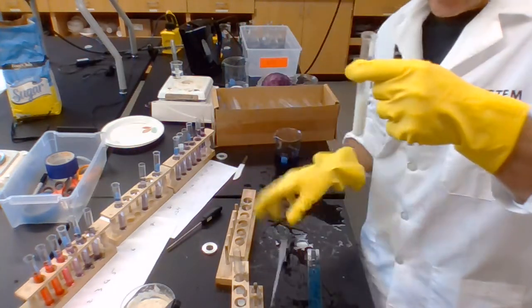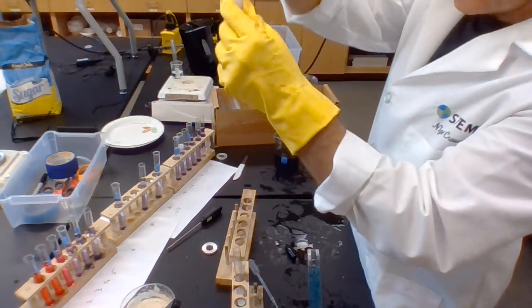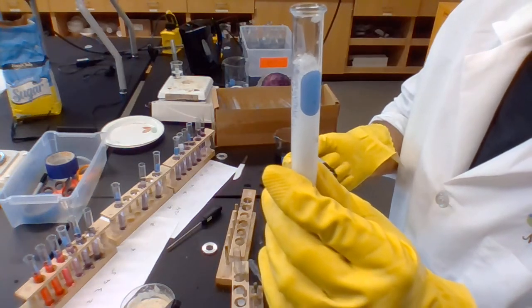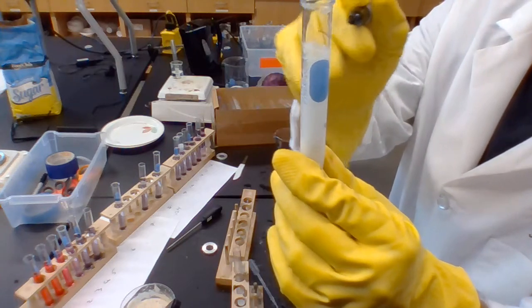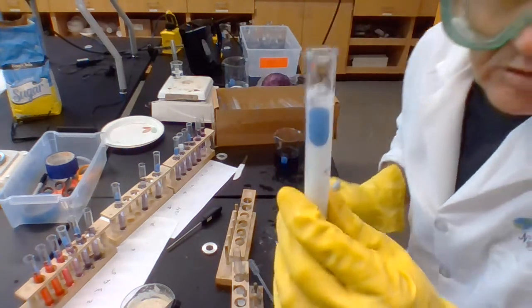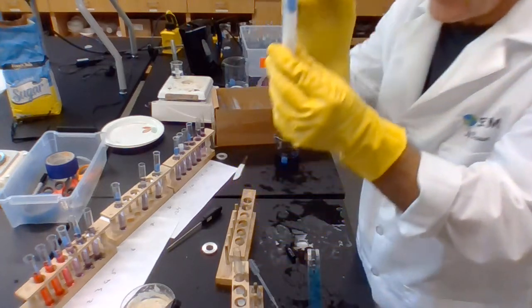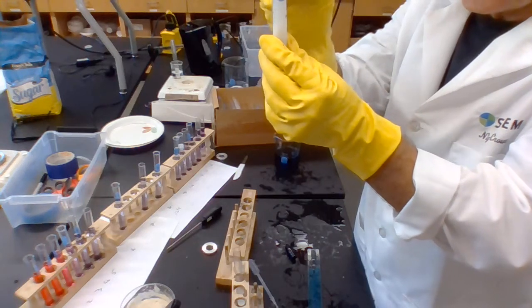Put this in, try and remember where it first was, and then have a look at the highest level of foam. And you can see if it forms water and oxygen, there, it's going down now. If it forms water and oxygen, it's going to form bubbles. It makes complete sense. Oh, it went up a bit. But it's still going up. Sometimes it reaches up to there.